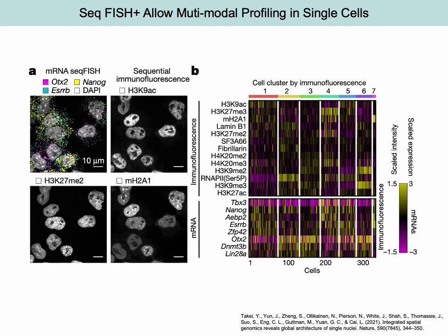But now, when we can measure single cells, like in the expression level, this reveals more information and gives us more chance to find out what is happening at that level. And not only can we measure the expression level in the single cell, we can also measure how long those heterogeneities in the global epigenetic state last. And due to the time limitation, I can't go into too much detail.